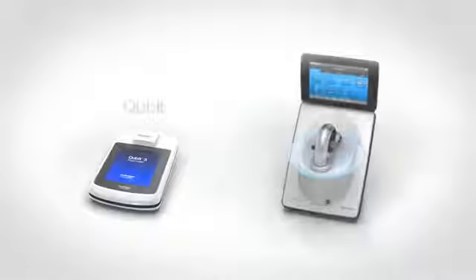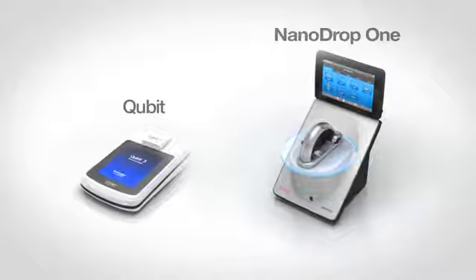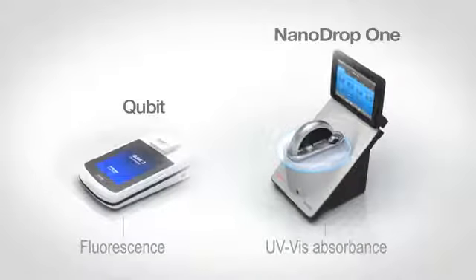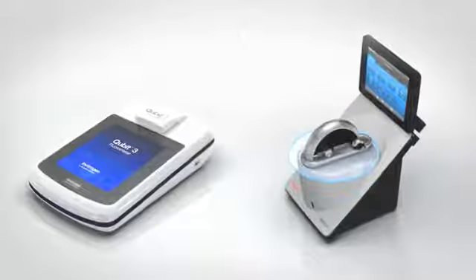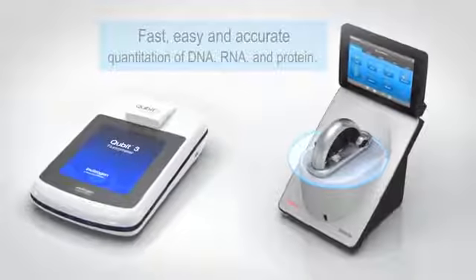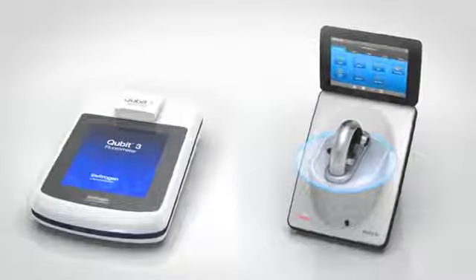This video will explain quantitation methods for nucleic acids and proteins using both fluorescence and UV visible absorbance. Thermo Fisher Scientific offers fluorescence and absorbance-based detection devices for fast, easy, and accurate quantitation of DNA, RNA, and protein. Both instruments require small sample volumes, normally 1 microliter.